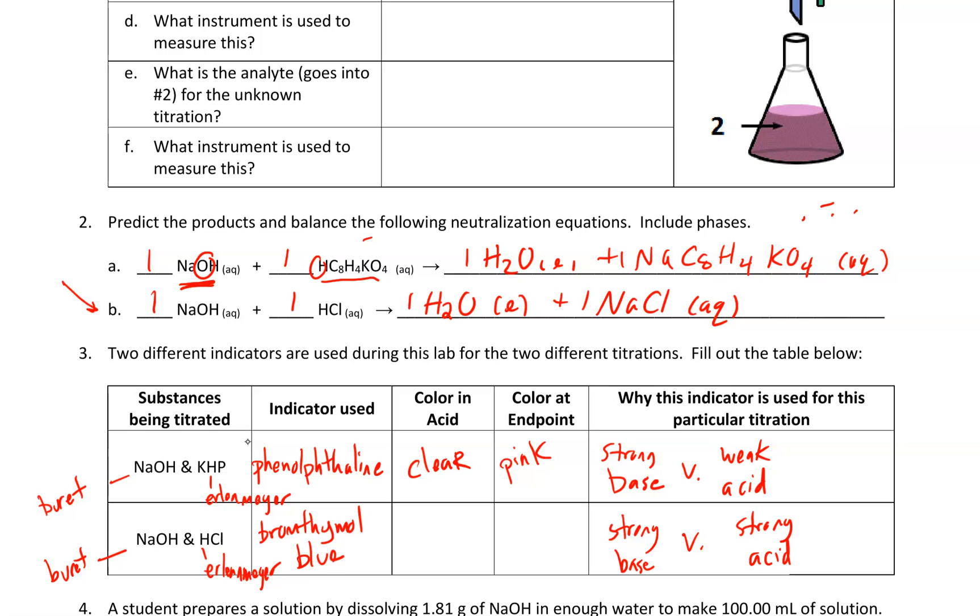When I put my bromothymol blue in HCl, my acidic solution, it's going to be yellow. So any educated guesses on what color bromothymol blue will be at its endpoint? Yeah, it is going to be blue.